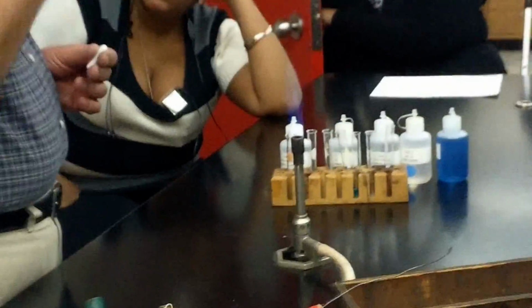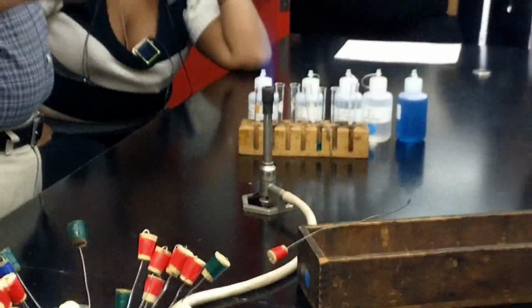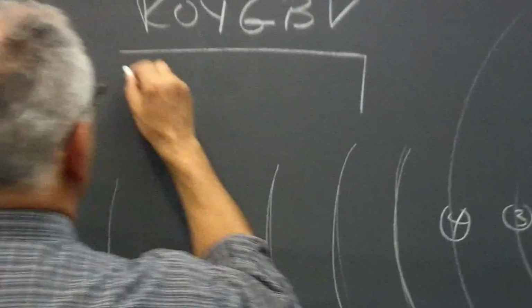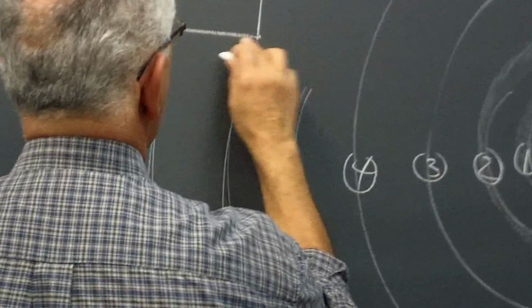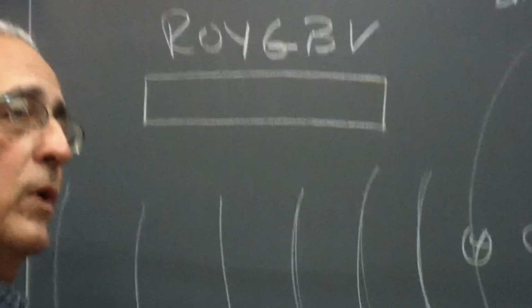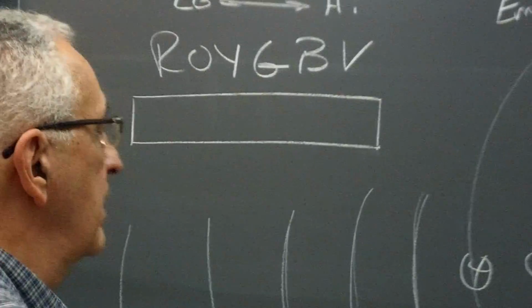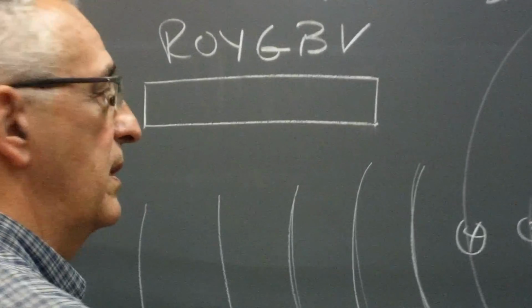So now, what you guys are going to do, there's two parts to this experiment. The first part of the experiment is we're going to look at the colors that are emitted by electrical current through a gas. The gas is going to be helium or hydrogen, two gases. We'll pass an electric current through those, and you're going to be able to determine the nature of that light. One's pink, and the other's kind of a yellowish, a pale yellow light. And you'll be able to look at the difference between helium and hydrogen.